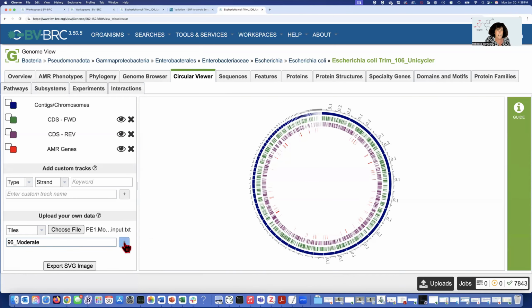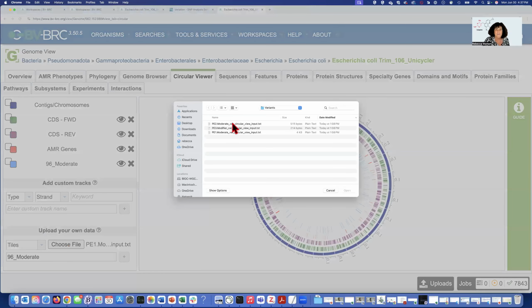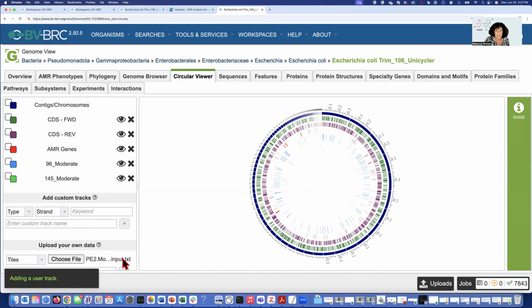So then I can click on the plus, and it's uploaded. And you know what? When I look at this, I can see that 96, it makes me, well, let's look at the other ones before I slander poor manifold 96. Let's see the other ones. So I can choose a second file, and I'll do number 2 and open that. And that one was 145 moderate, and add that.